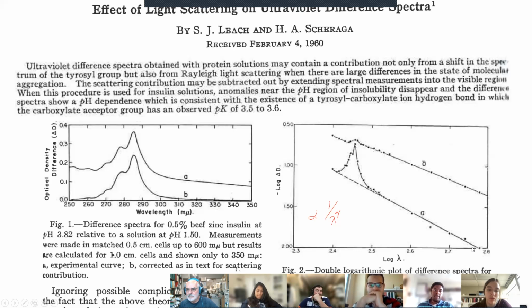This particular sample has this slope, subtract that from the raw data. And when you do that, the scattering in the 320, 330, 340, 350 region goes away. Now the extinction, the absorbance that you get at these values is a true reflection of concentration. In A, this was concentration and scattering. You had no idea what the concentration actually was until you corrected for the scattering, okay?